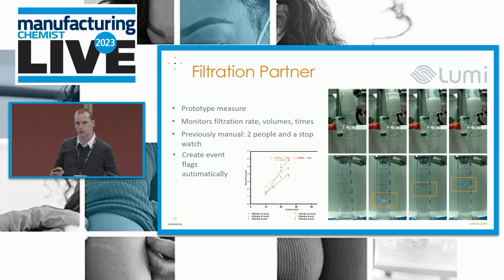So instead of having two people, one with a stopwatch writing furiously down, which is what we were doing before, you've got a camera, the data is there, there's no chance of misreading or falsifying any data, and it's automatically produced for you. That plot of time is produced, and that's what we want. And once you've got that data, you can start to do automatic other manipulations with it. You can start to produce process relevant information from these experiments just by pointing the camera at it.